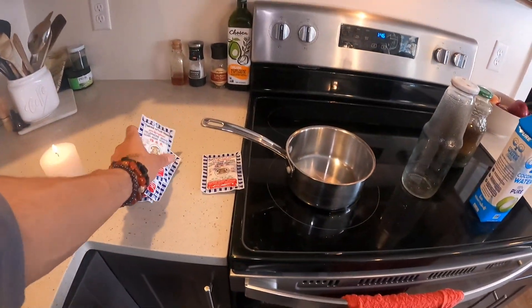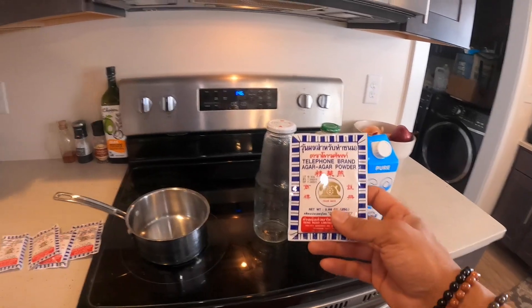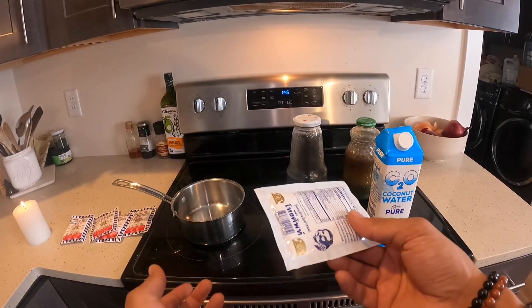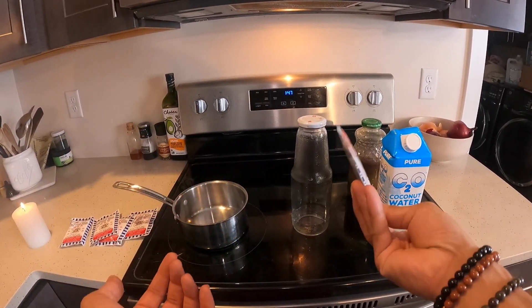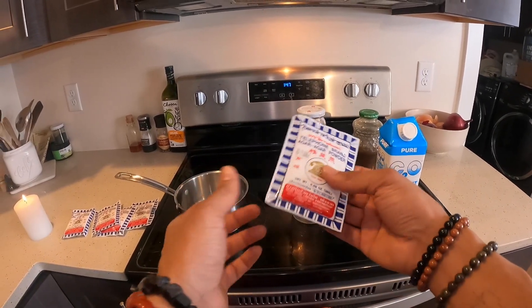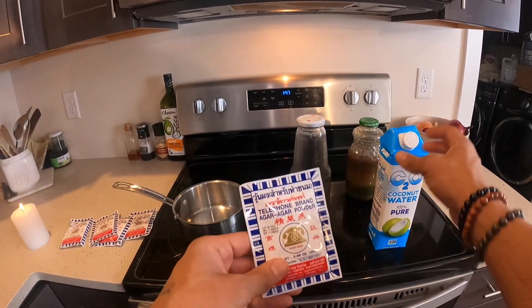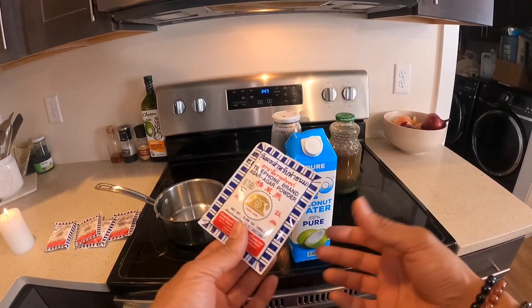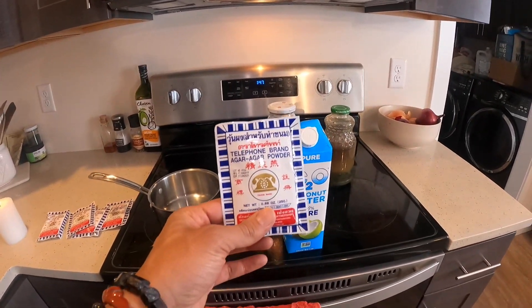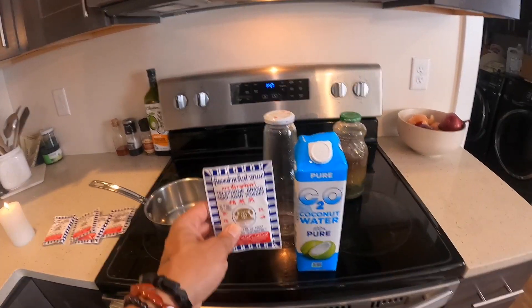The agar we're going to use today is this Telephone brand agar — I get this at the local Asian grocery store here in Harrisburg, Pennsylvania. If you're going to do this at a larger scale, you can order larger packs of agar to reduce plastic waste. The recipe is 25 grams of agar to one liter of coconut water — that is my go-to recipe. These packets come in 25 grams, which is probably why I do it this way.